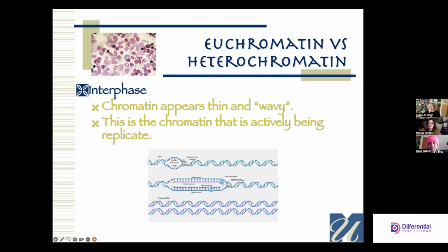Monos, unlike granulocytes, never really get to a dark, clumpy stage of heterochromatin. They stay this thin and wavy because, what do granulocytes do? Granulocytes eat, yay. You know, monocytes, on the other hand, they recognize trash from infections. They can either kill or degrade.